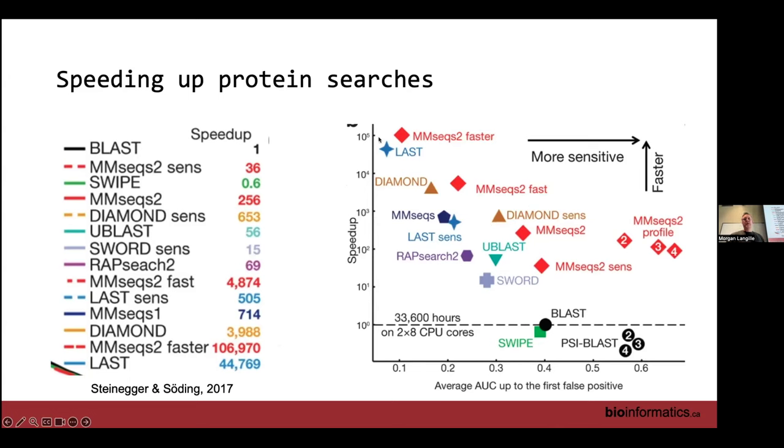So what then happens, I guess, is that people will develop annotation systems. They'll essentially take mappings from somewhere at some point, like UniRef to KEGG or UniRef to MetaCyc, and then try to use that mapping in the background. But then obviously you're a bit limited on what you can extract, like if you're interested in a particular functional pathway, if you have to go to the database, obviously if it's privatized, well then that's a bit limiting. So yeah, there's still essentially tools, and as far as I know, KEGG and MetaCyc both let you still do this, the mapping in the back end, and so you'll get the pathways. But their greater suite of tools, including the most updated functions, is under license.